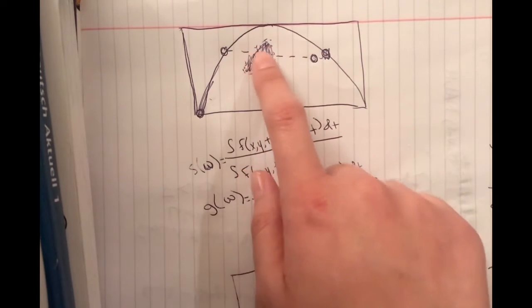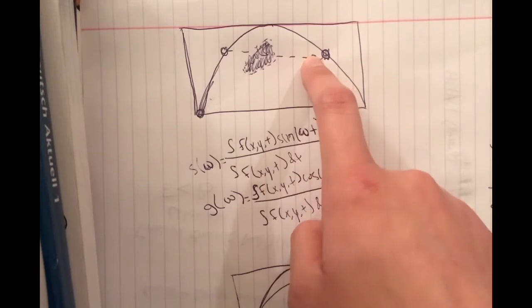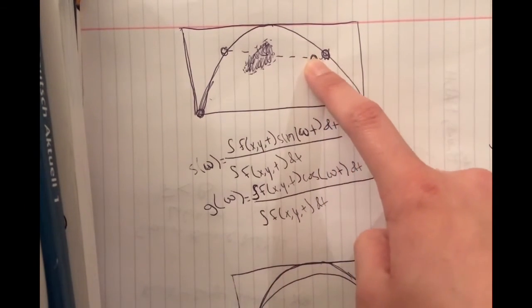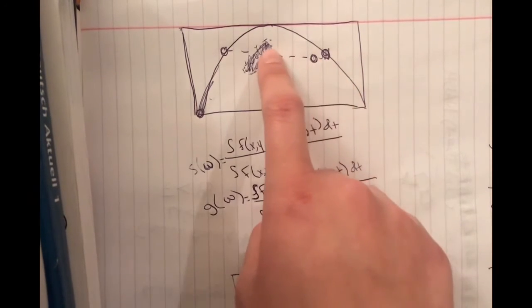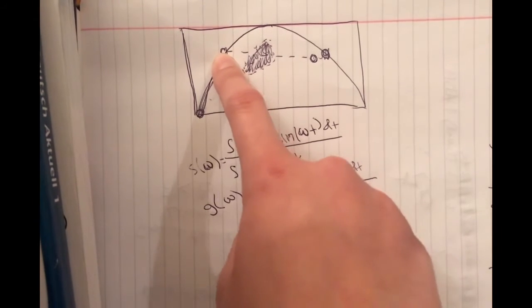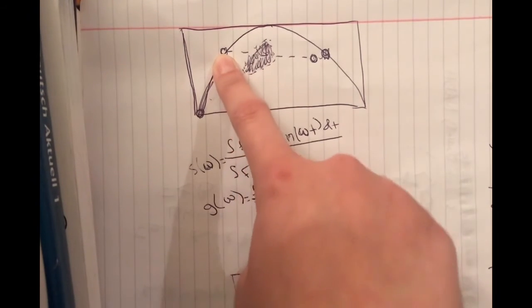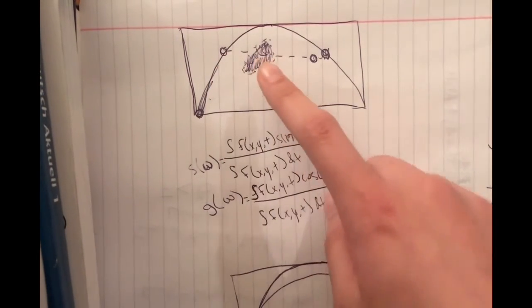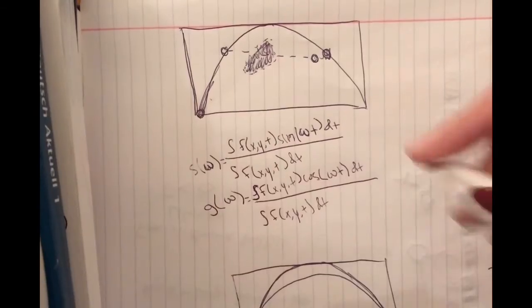As the graph moves further towards the right, it falls towards NADH's more folded state, which means it's more associated with cancer. However, as it moves back towards the left, it is where NADH falls into its extended state. So by looking at this graph, we can essentially tell its extended to folded, or free to bound, ratio, and by that determine whether the cell is cancerous or not.